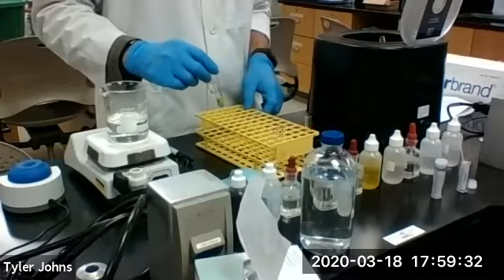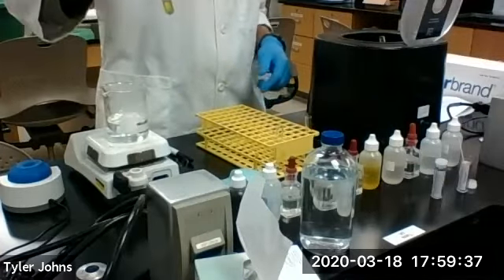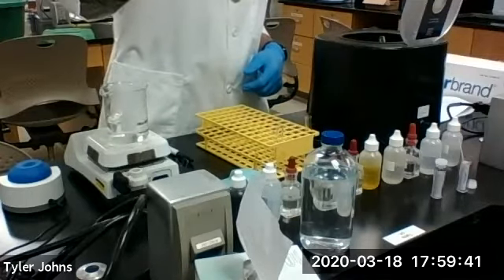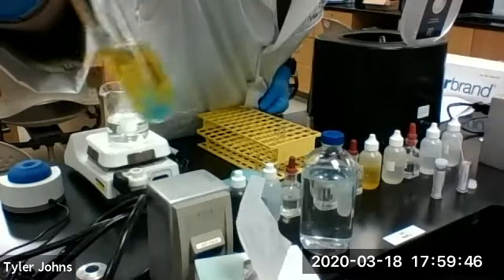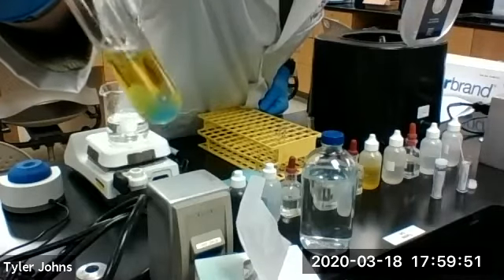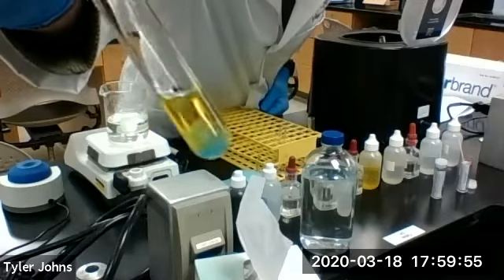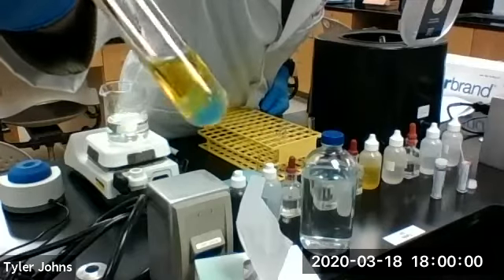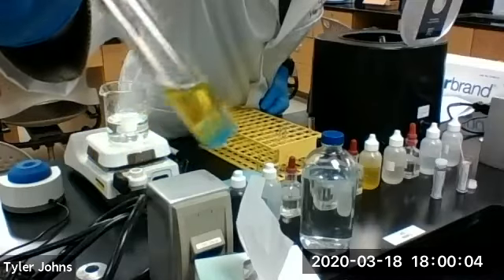Okay, it's been a couple of minutes, and you can now see that we have the characteristic blue lake of the magnesium hydroxide. See that blue precipitate? That is further confirmation that magnesium ion was present.